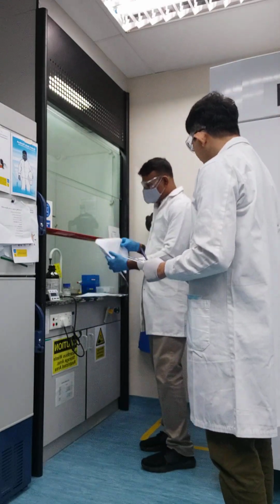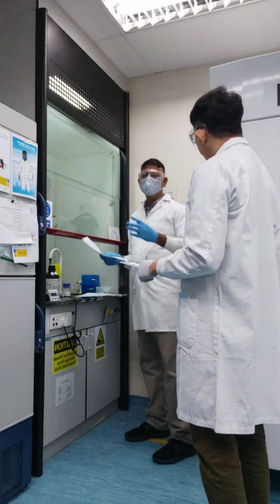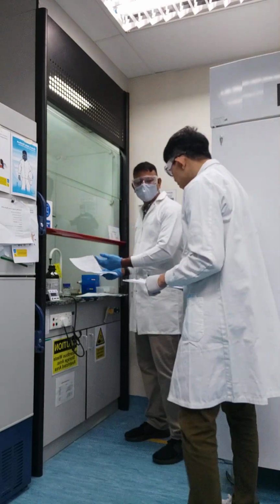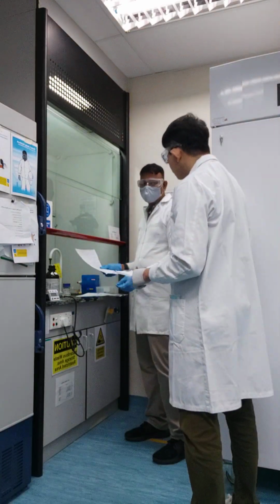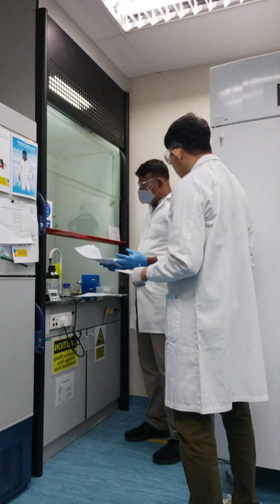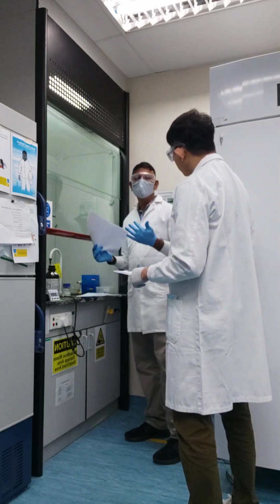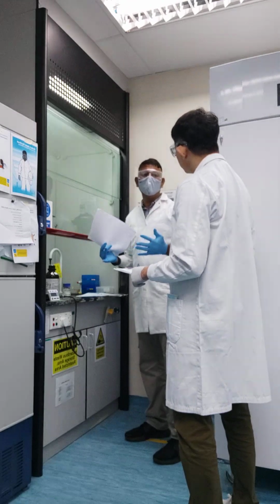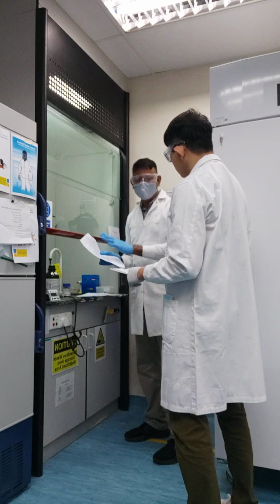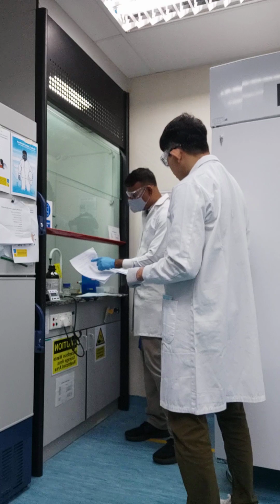Okay, Leon? Yep. This is step number 1. Alright. Step number 1 is to verify whether you have chosen the correct solution and reagent according to the batch sheet. Alright. You know why we are doing this? Not sure. Alright. So basically we need to identify the correct material, because we do not want inadvertent mixing of the chemicals. So that's why we have a batch sheet. The batch sheet is issued according to the test method. That is why we would like to make sure that we verify.